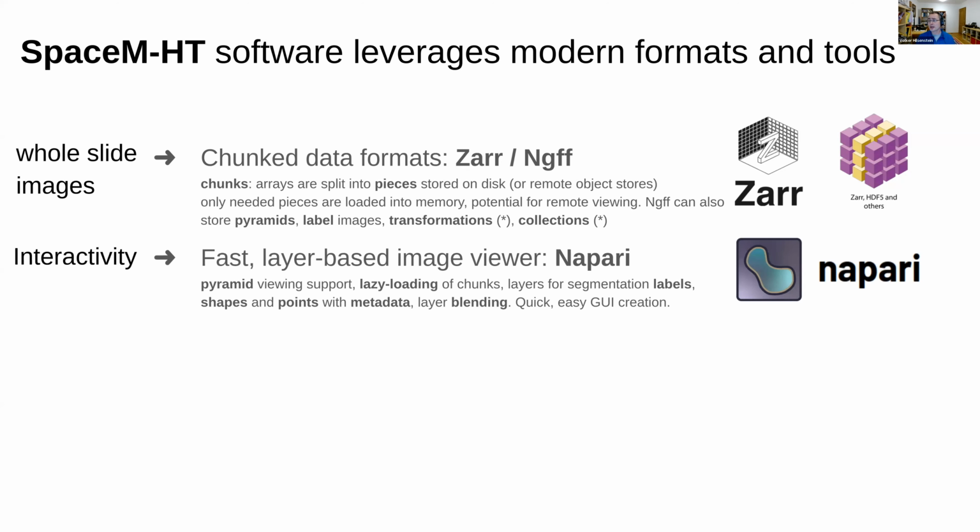The other thing is napari. During my time in Australia, I worked with Juan Nunes Iglesias, who is a very close collaborator, and he is one of the co-founders of this project. So I saw this from the early stages, and as a Python aficionado, it was nice to see an alternative viewer emerging.